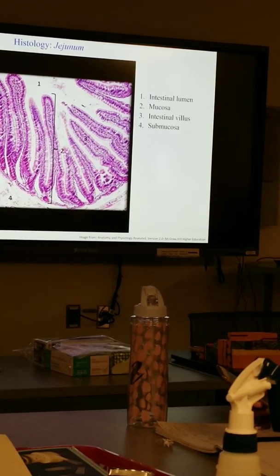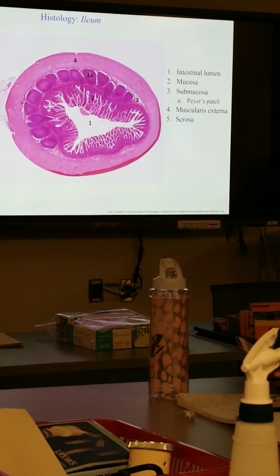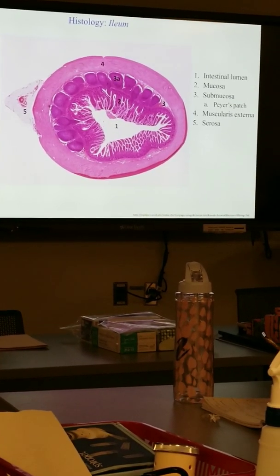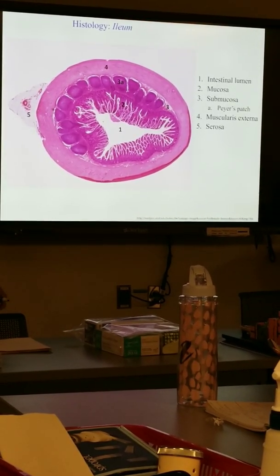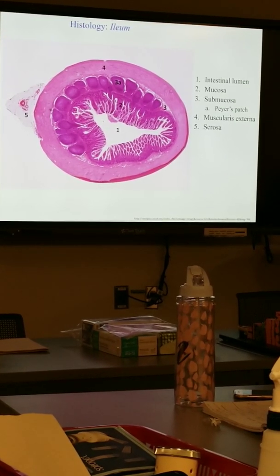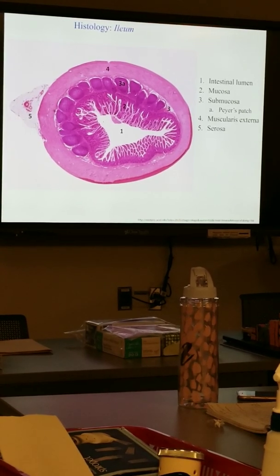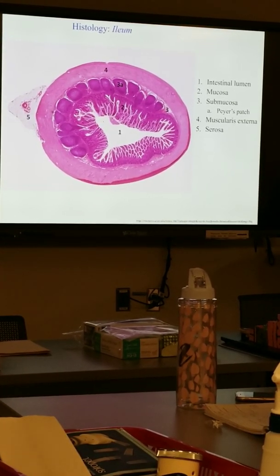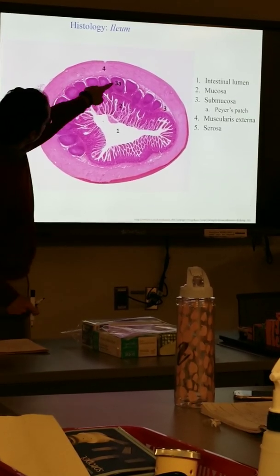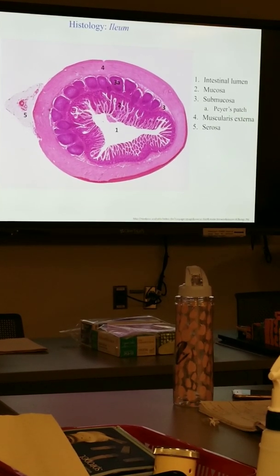All right, and then from the jejunum, we move into the ileum. This is admittedly a much lower magnification, but it really brings out, again, those structures that are going to help you, if you're shown a region of the small intestine, distinguish whether it's duodenum or ileum. And that is generally in the submucosa, the submucosa where you find these depicted in this particular section.